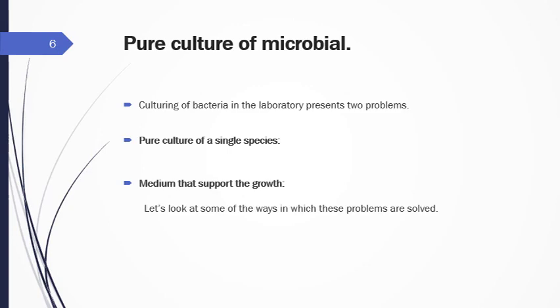The artificial culture of any organism requires a supply of necessary nutrients together with the provision of appropriate conditions such as temperature, pH, and oxygen concentrations. The nutrients and conditions provided in the lab are usually a reflection of those found in the organism's natural habitat. It is also essential that the appropriate steps are taken to avoid contamination.